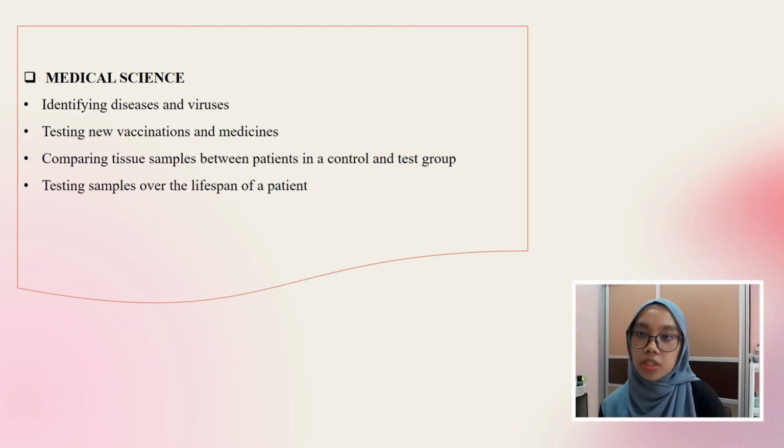All of these applications are done thanks to SEM. High-resolution three-dimensional images are produced by SEM that offers speedy and accurate measurement.